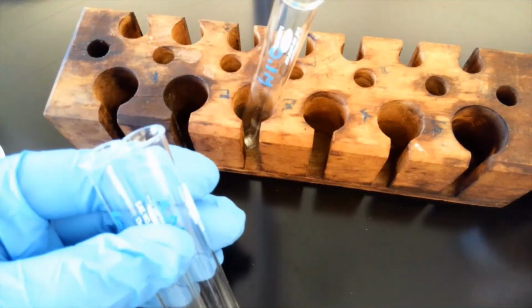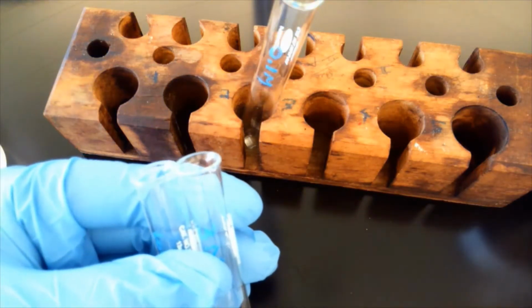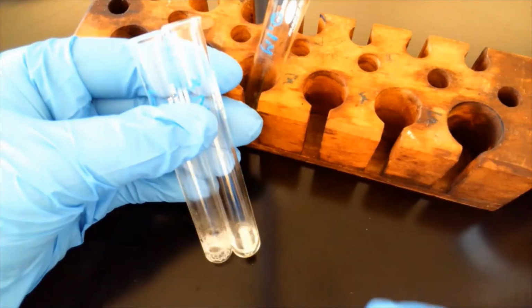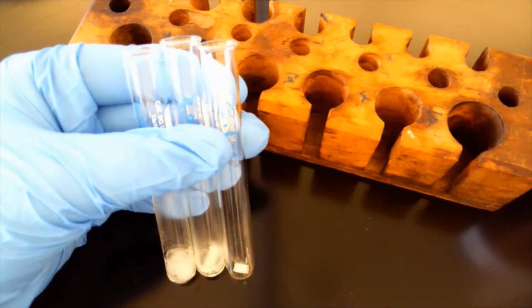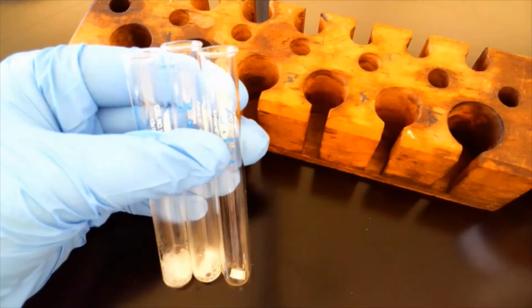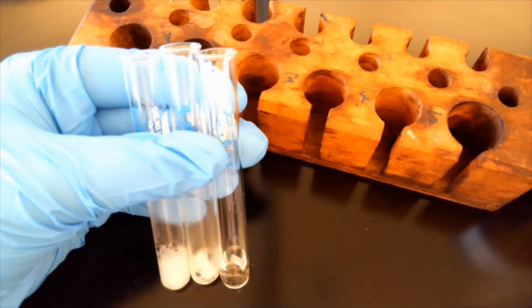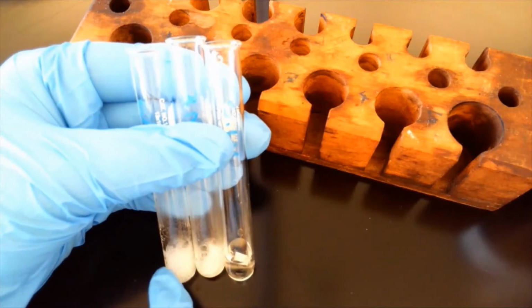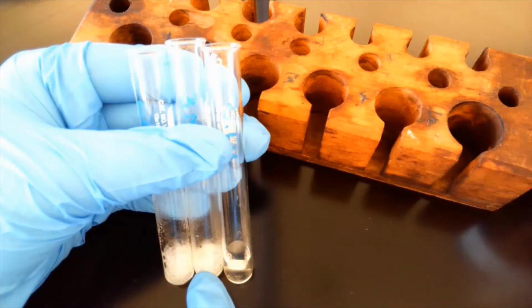So with 3 molar, we'll add that right next to it. Again, you're bubbling. It's getting warm, nowhere near as vigorously as the other one. And then we're going to do 0.1. So here's 6, here's 3, and now we're going to have 0.1. Not much is happening with the 0.1 molar. So very, very small bubbling. The 6 molar is very vigorous bubbling and actually getting very hot to the touch. Again, the 3 molar is a similar amount, but not as vigorous, and then very, very little.